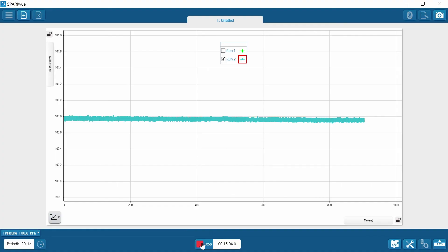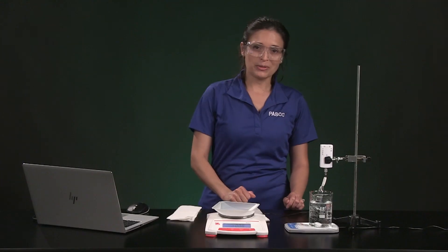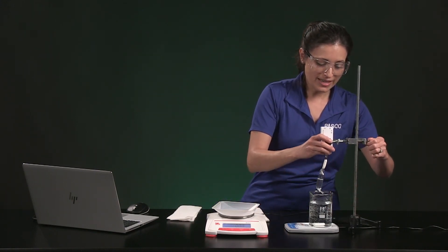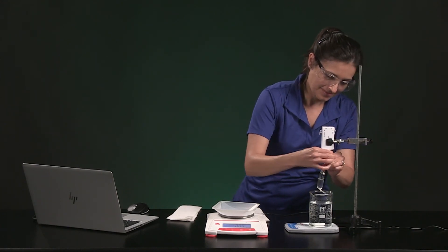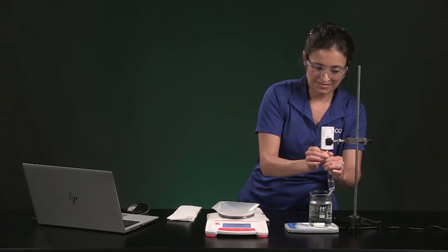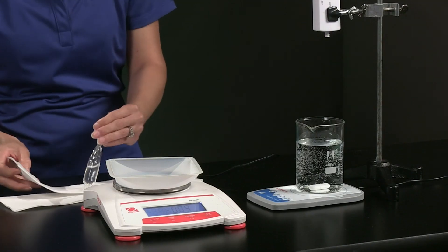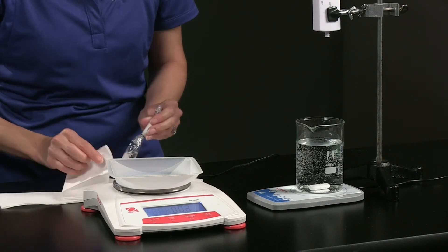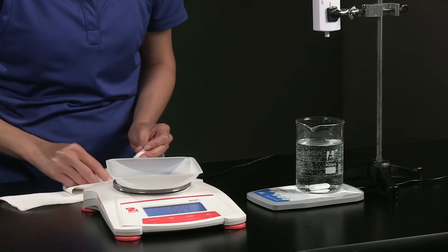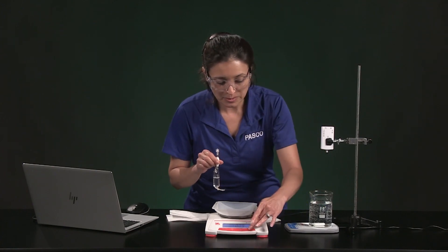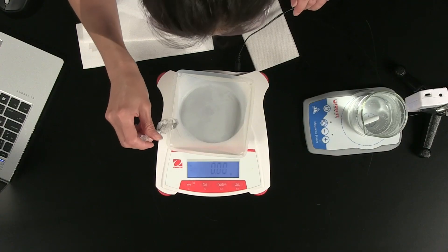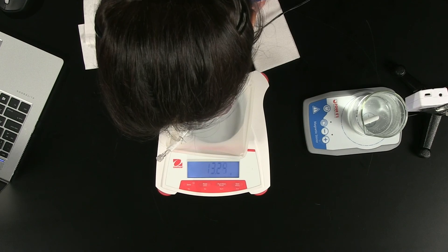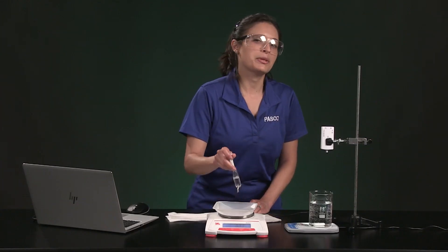It has been 15 minutes so I am going to stop collecting data. And now you can record the final mass of the water bag in table one. I am going to turn off the magnetic stirrer and retrieve the bag. I am going to dry the bag as much as possible. And I am going to record the mass. The mass is 13.13 grams.